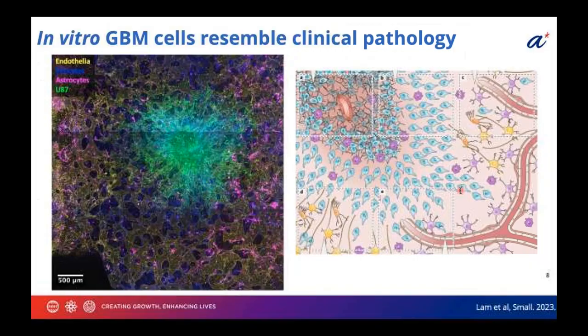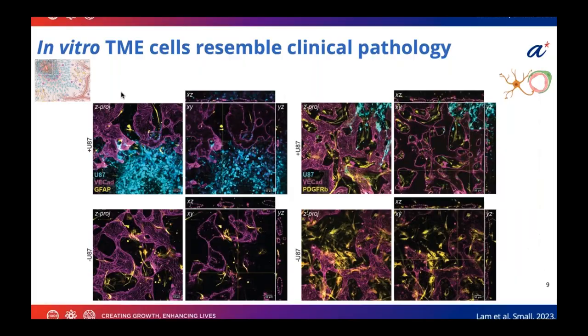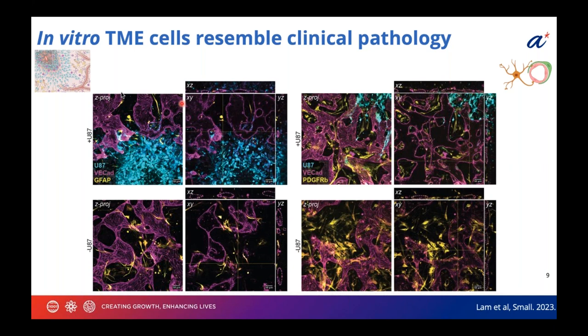Here I have an in situ immunofluorescence staining of one such device after 7 days of culture. I placed this image right next to the cartoon that I showed earlier because I wanted to show you how similar the pattern of invasion of the GBM cells in green is to the cartoon. You can actually see this dense core and the very diffusive infiltrative front. And if I zoom in more and look at how the BBB cells are interacting, we see even more similarities to the clinical phenotype.